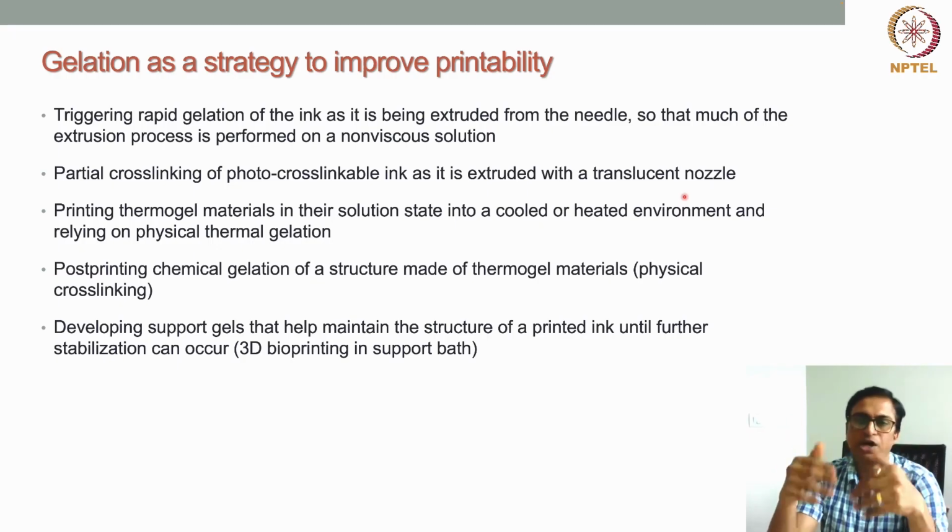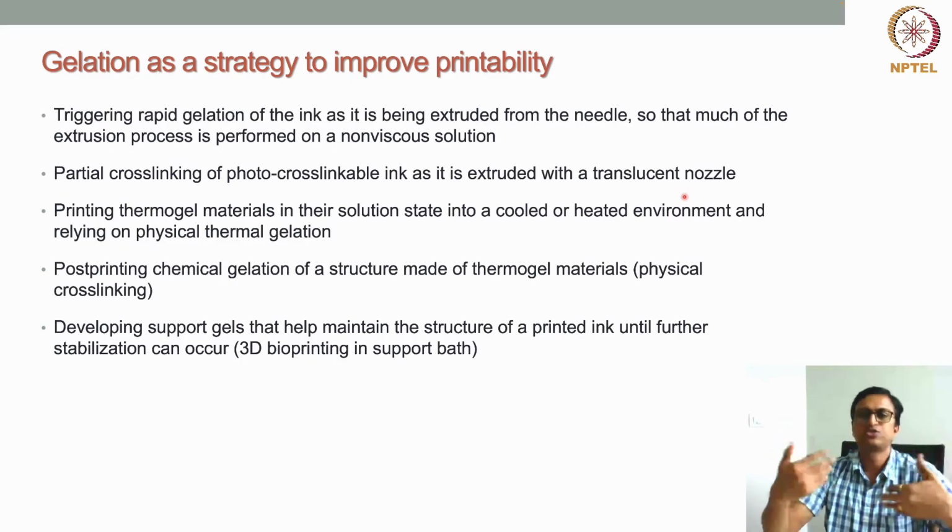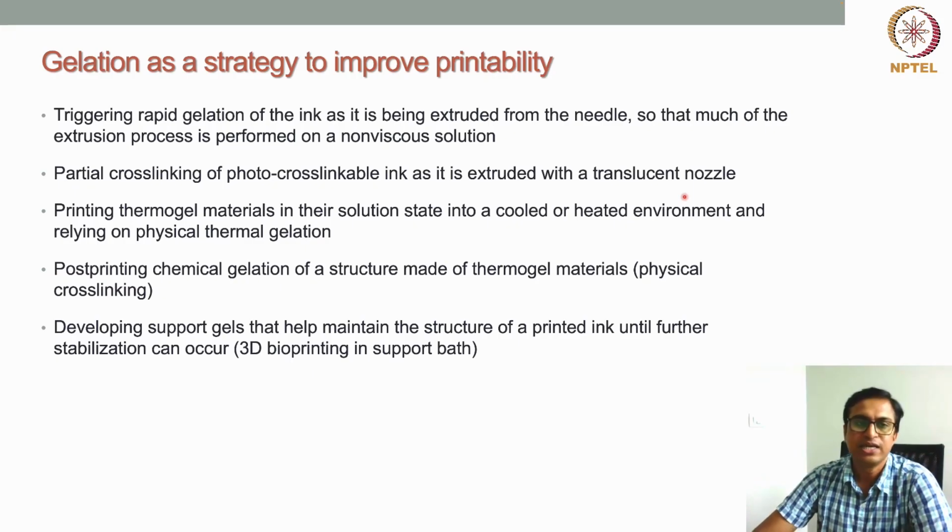The same thing can also be done with gelation. A rapid, instantaneous gelation of the material as soon as it comes out of the nozzle can be done. So triggering rapid gelation of the ink as it is being extruded through the nozzle, so that the extrusion process is performed on a non-viscous solution.